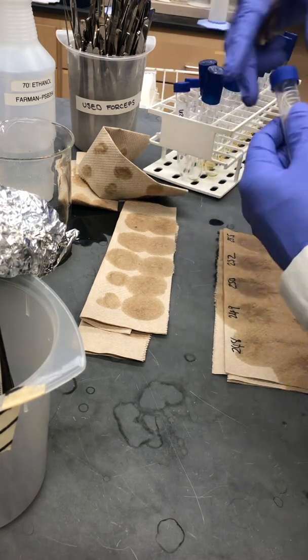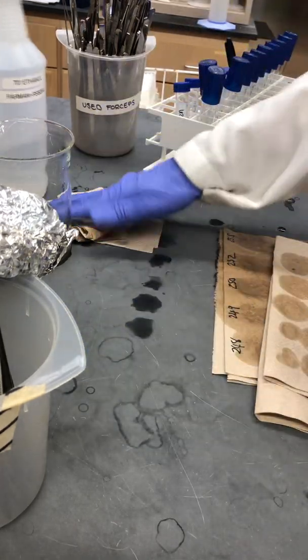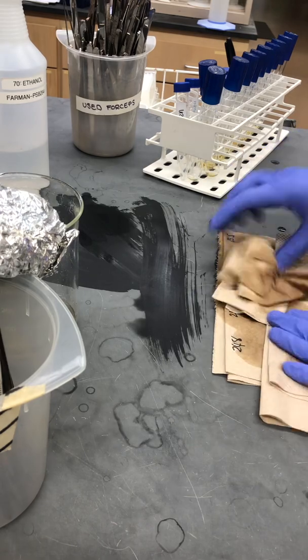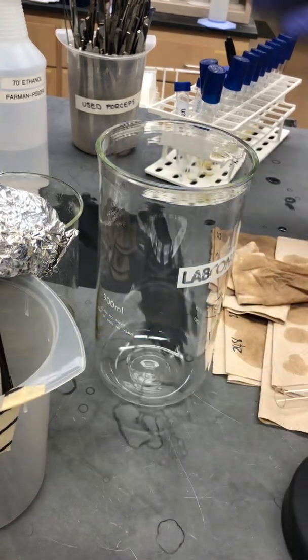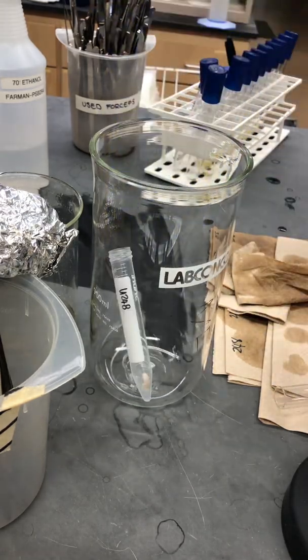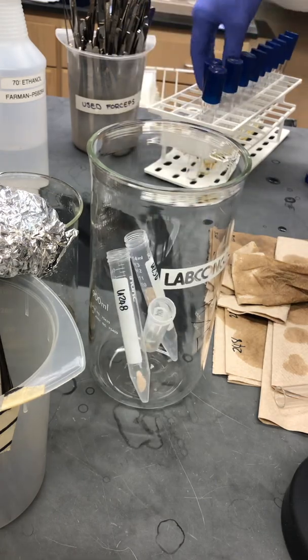We're just going to put the tube caps on very, very lightly. Next thing to do is to mop up any spills — this surface will get treated with ethanol to sterilize it before washing. Next step is to put these tubes into the freeze-dryer, so I'll just grab a freeze-dryer flask.